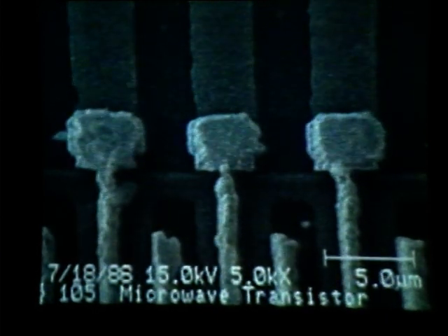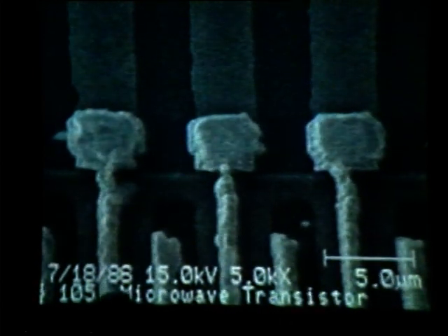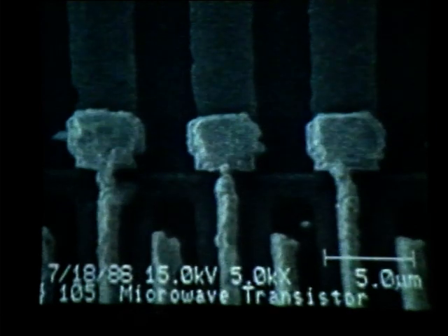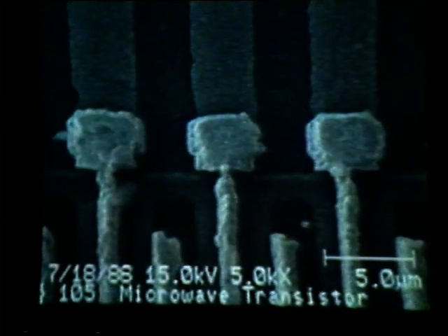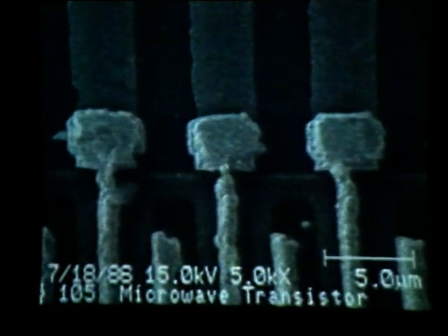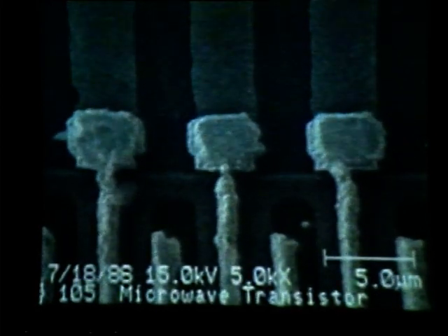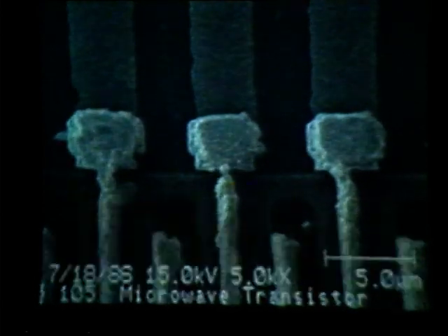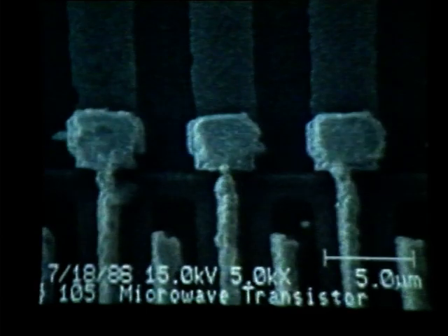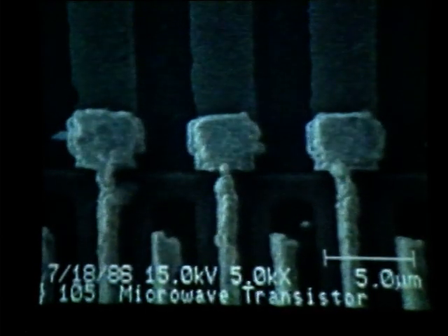If we do not agree with the fields, for example, if we have the wrong comment or the wrong photo number, what we can do is press the escape key, abort from the photo, and then enter the Setup Photo menu by pressing the Shift key and function key 20. Then we can change any of the comments, photo numbers, or fields which we do not agree with.